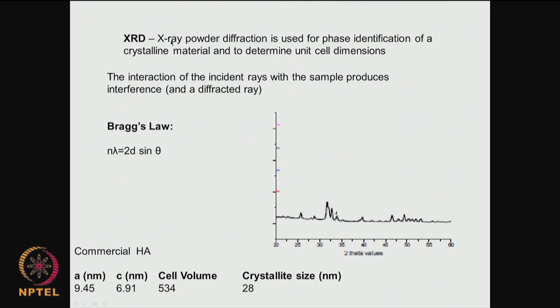We can look at whether the material is crystalline or loses crystallinity because it stays inside the body, because crystallinity has a lot of effect on other properties like melting, maybe the degradation and so on.